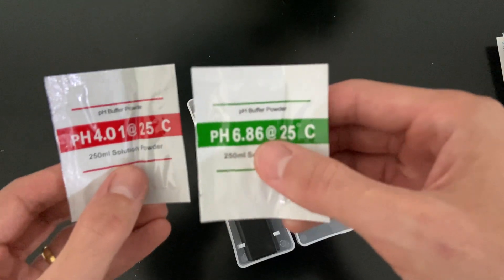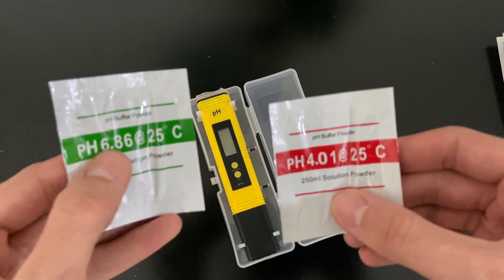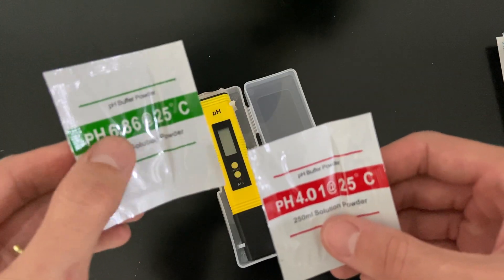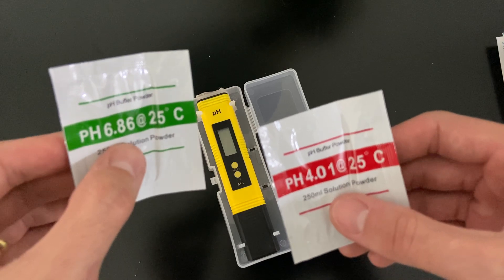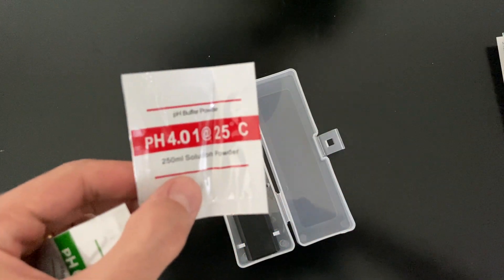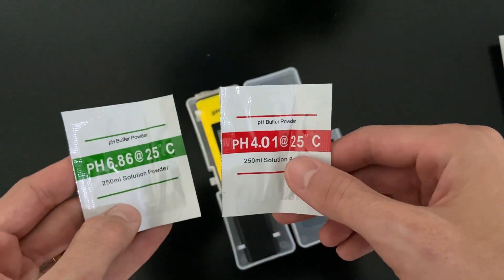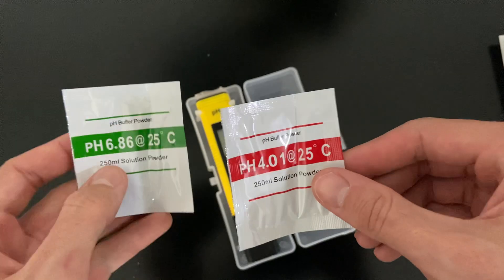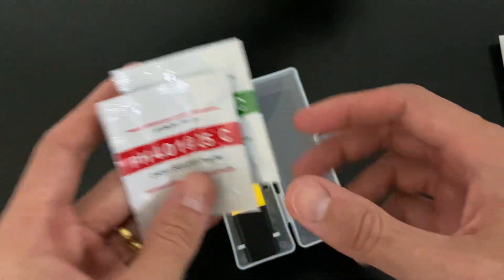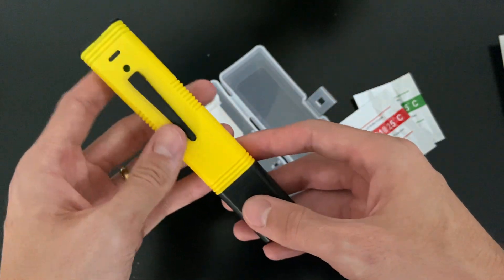Okay, so here we have two pH solutions. This one is 6.86 and this is 4.01. These are to calibrate the pH meter pen. Very cool. And this is the pH pen itself.